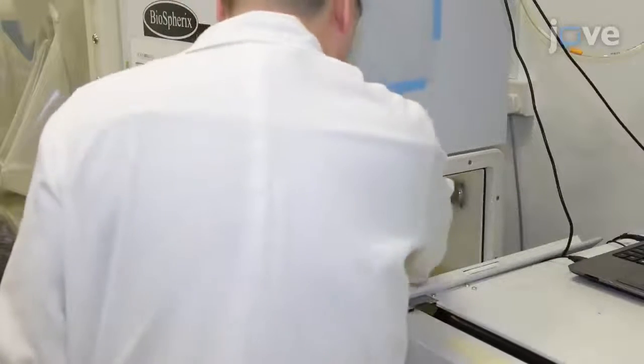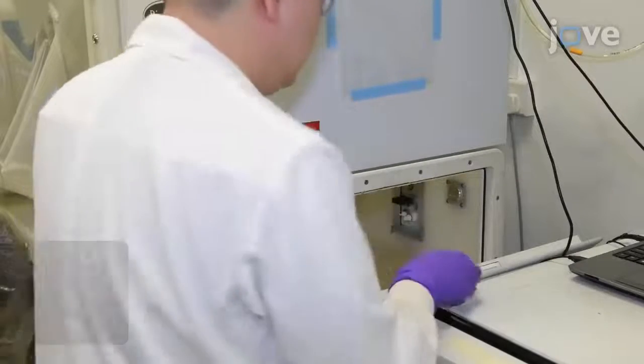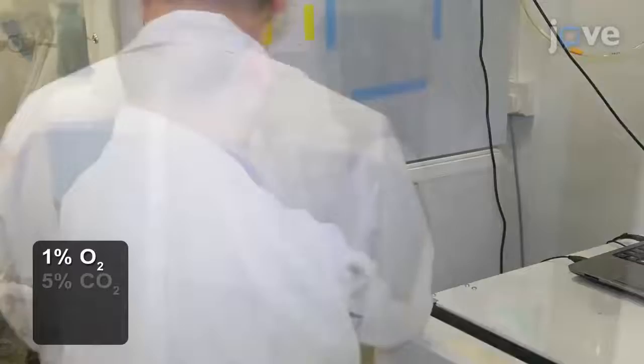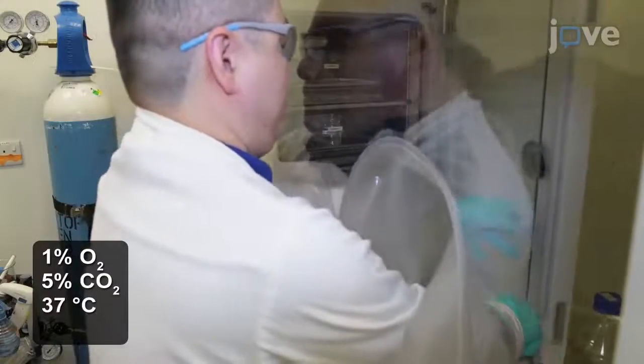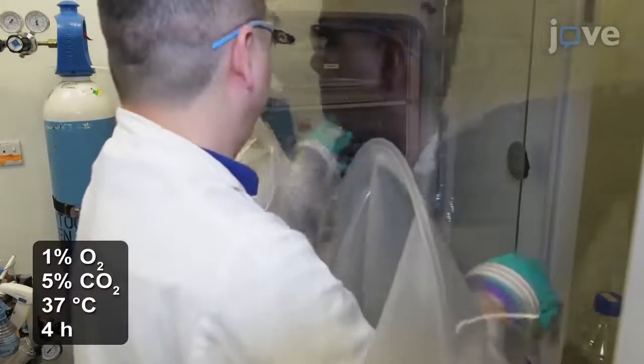24 hours after seeding, when the cells have reached 80 to 90% confluency, put two dishes into the hypoxia subchamber in the incubator glove box with 1% oxygen and 5% carbon dioxide at 37 degrees Celsius for 4 hours.